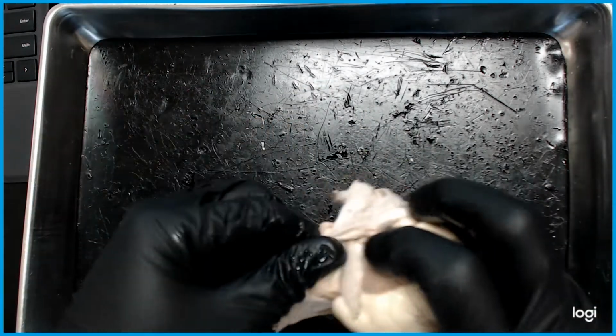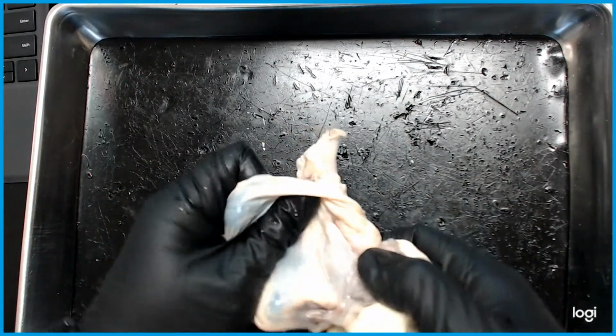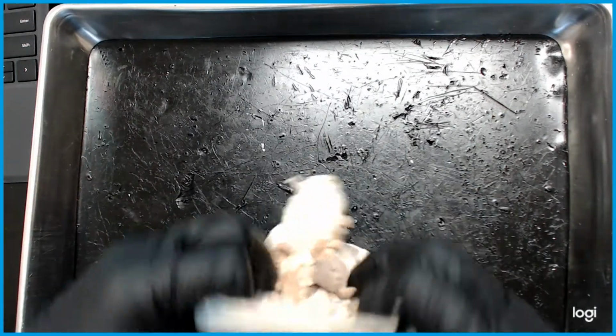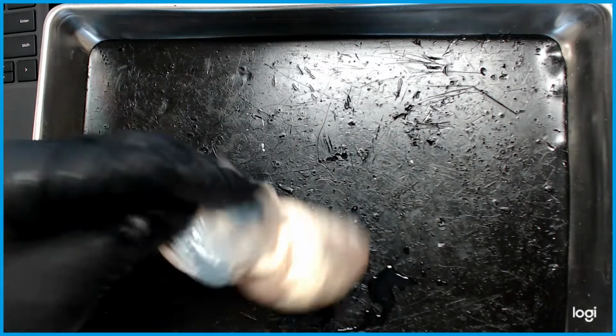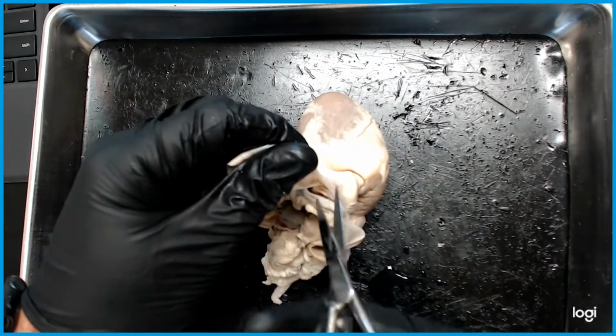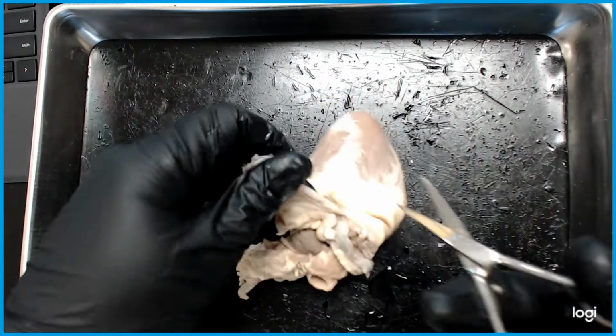Now remove the pericardium. You cannot just yank it off, so don't do that. You must be careful because there are other vessels here, or parts that we might cut off accidentally. So you want to make sure that you cut through those as close as possible.